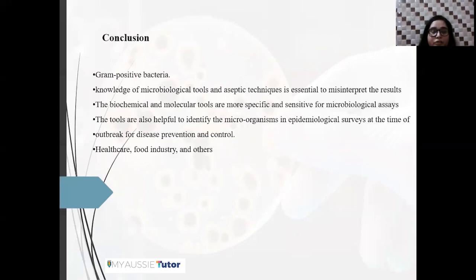So we can say that identification of bacteria is a very skillful technique, and the technicians must understand the need and must perform these tests aseptically in order to identify the characteristics of the suspected bacteria. With the help of molecular tests, the actual bacteria at the species level will be identified, so that the causative agent of the illness will be detected and the safety of the patients can be increased. So this all was about how we can identify bacteria which can cause serious human diseases.